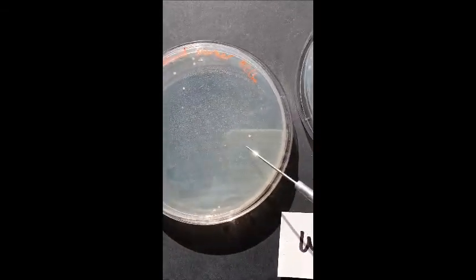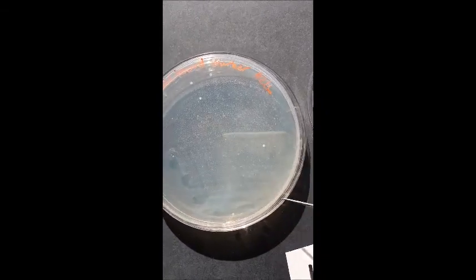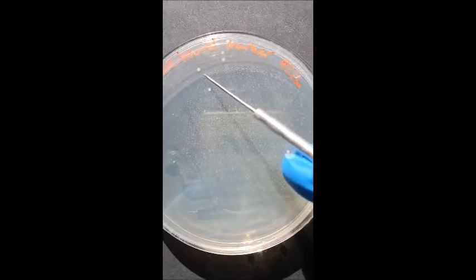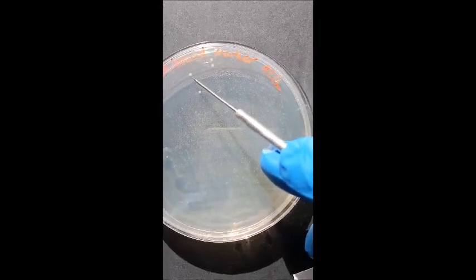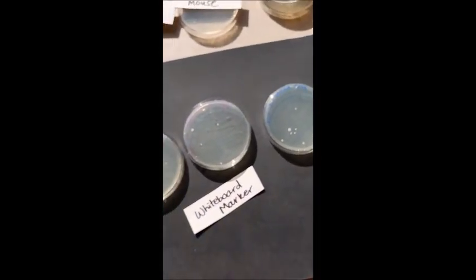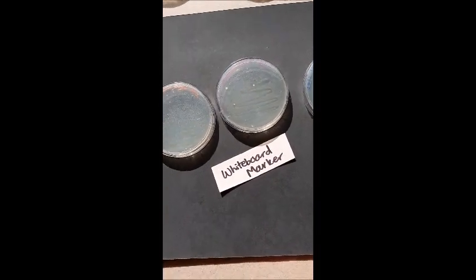This white one is on all of them: 1, 2, 3, 4, 5, 6, 7. And see, look, that colony looks slightly more yellow, so I think that's the different bacteria. Again, same. So there you go, there's the whiteboard marker.